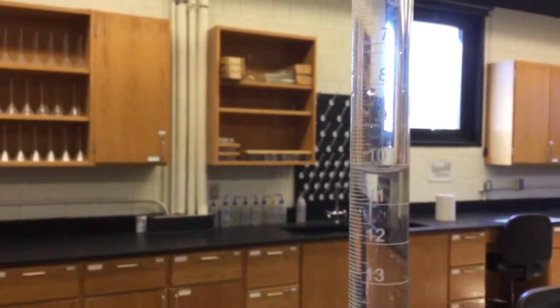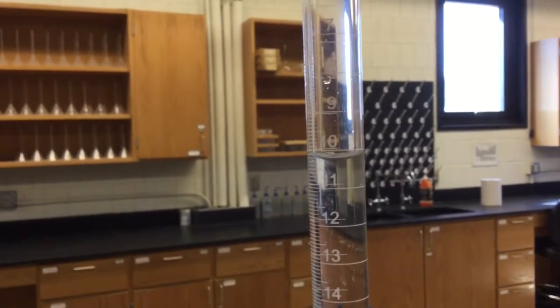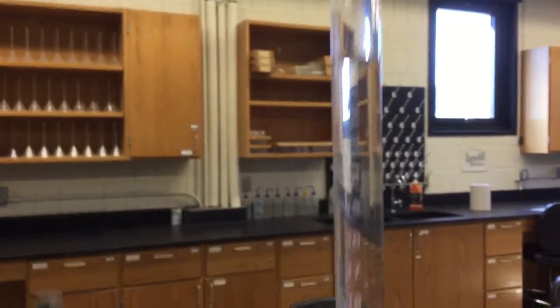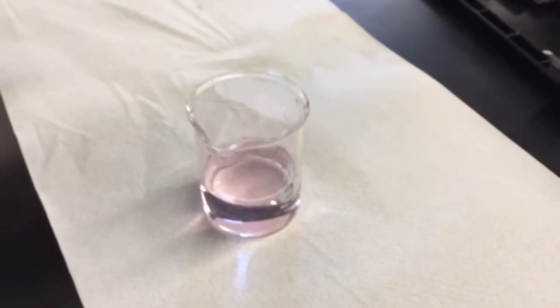The endpoint looks to be about 10.25 milliliters, so we'll write that down as the endpoint. From that you should have all the numbers needed to do your calculations.